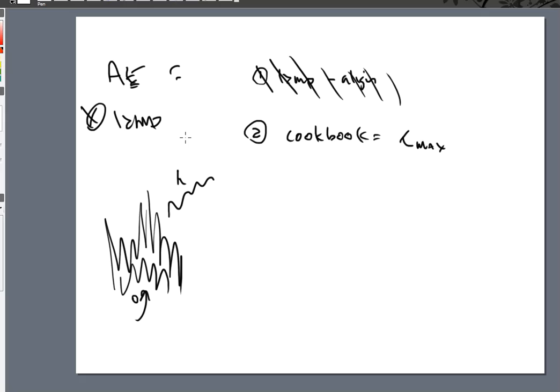So if we can tune in the detector to the wavelength that we need for it to look for, then that detector can do its job much better, and it can look for sodium only. And when it sees that wavelength escaping and screaming out by these burning little sodium atoms, then we will be able to pick that up on a computer screen and within the software and in terms of absorbance.